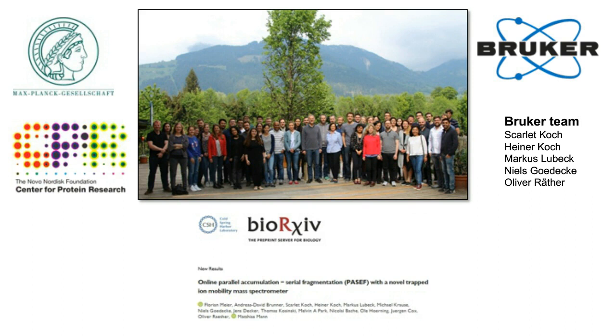Our last question is, what is the impact of highly charged peptides in timsTOF Pro? They can be separated by their ion mobility, just as their lower charged counterparts. Typically, we are working with tryptic digests, so most of our peptides will have charge 2 or charge 3, and we don't have much experience with longer peptides.